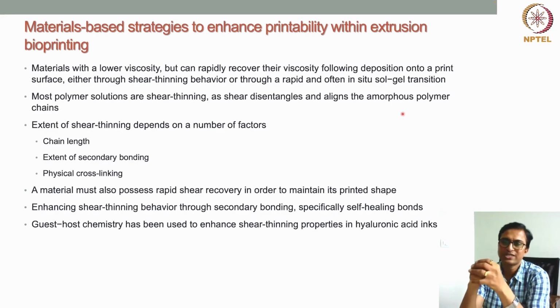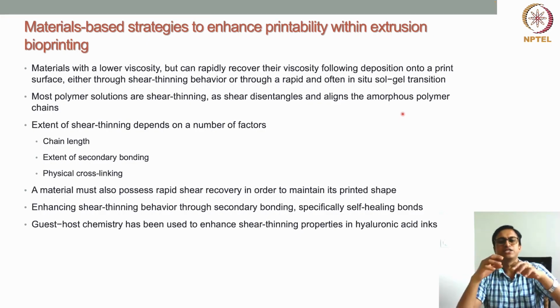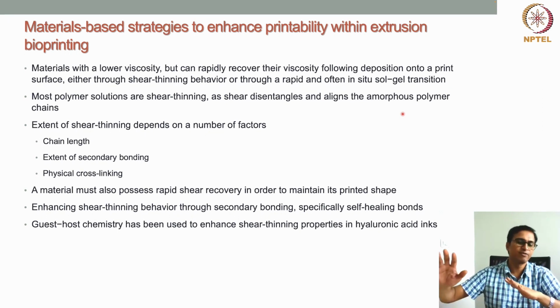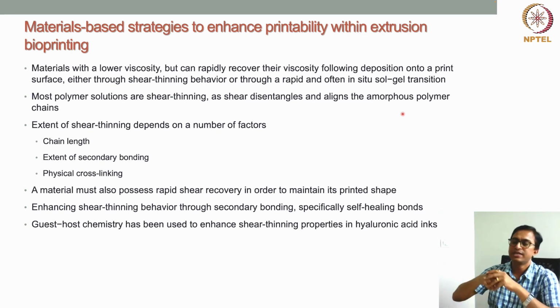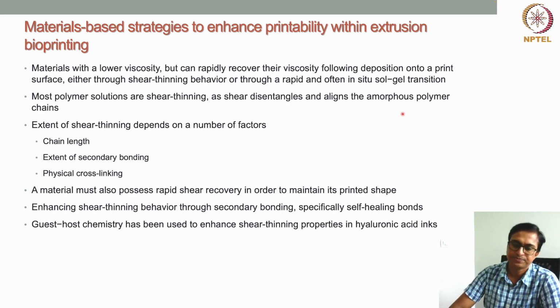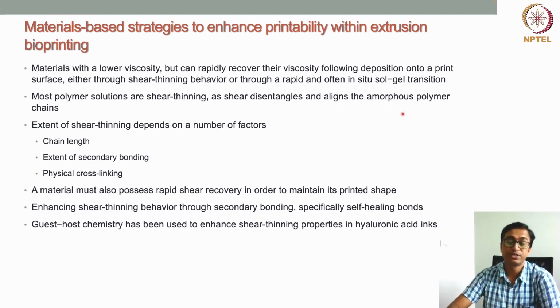In this way, the material will have a very high viscosity. But when there is a shear force, that whole hydrophobic interaction can be disrupted and the material can start flowing. Again, when the shear is gone, this host-guest chemistry helps in retaining the shear thinning property, which means at low shear the material viscosity will be high.